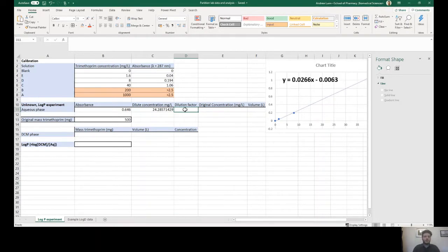So that's a dilution factor of 20. If you're unsure how to get that, the way you can reach a dilution factor is you take the final volume that you end up with and divide it by the amount of the more concentrated mother sample that you put into that. So in our case, we had 100 millilitres of the final sample size and we had originally put in 5 millilitres of the more concentrated mother sample. So that would be 100 divided by 5, which is 20. But you can also just work that out intuitively if you can do so. So we've got a dilution factor of 20.